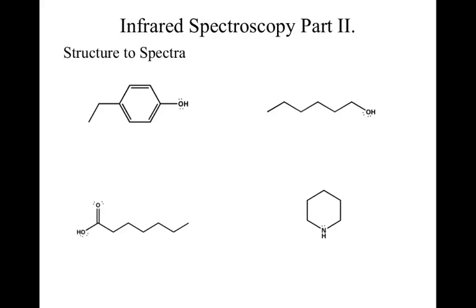Backed by popular demand, we get a little bit more on IR spectroscopy. When we ended that last video, you were looking at going from the spectra to structure. So now let's take a look at the reverse. Let's do the structure to the spectra. If you're given the structure, you have a big advantage here. You now have a whole bunch of different pieces that you could look at.